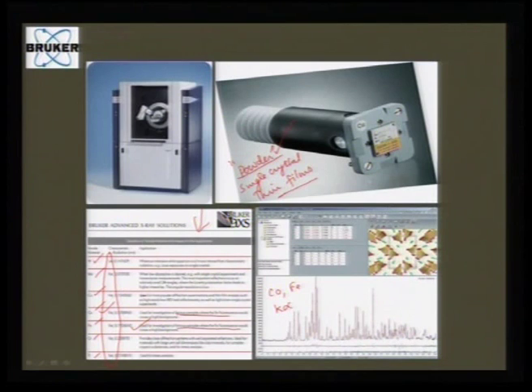But copper is ideal for most diffraction examinations and for thin film analysis also. So, copper is used in many of the laboratories. And then you also have molybdenum. When low absorption is desired, that is with single crystal experiments, it is molybdenum that is usually used. And this is again the rear view image of the target that I have been mentioning to you. This is a copper K alpha target which is used in the instrument. And today the version of X-ray diffractometer is much different from the earlier ones.